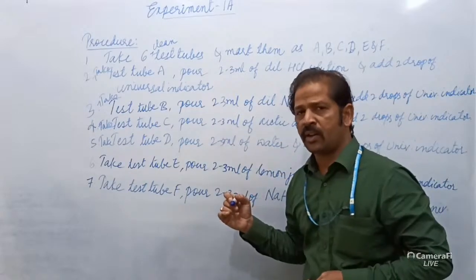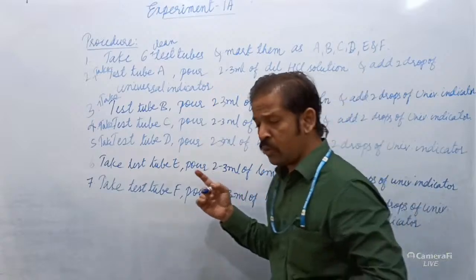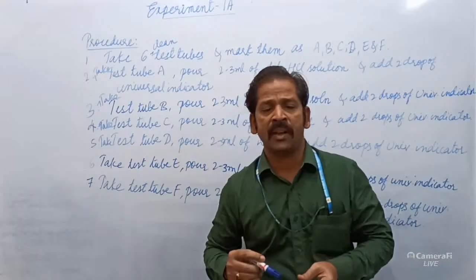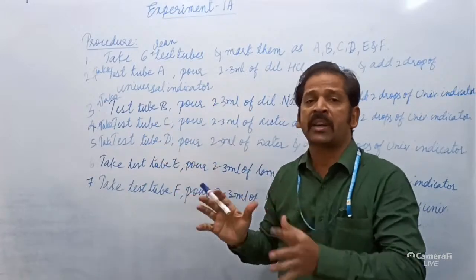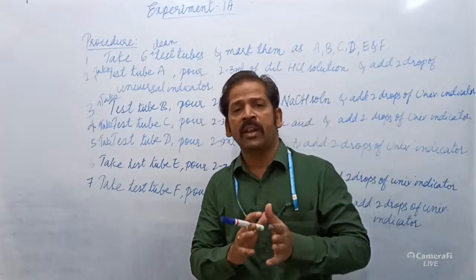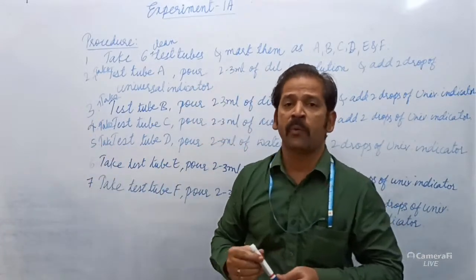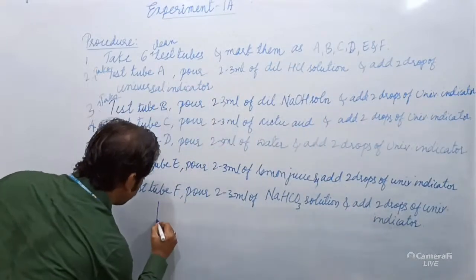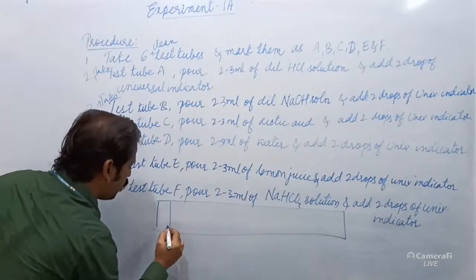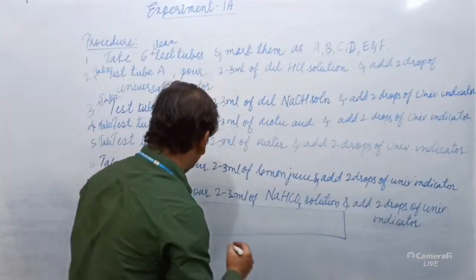Whatever we have discussed about all the chemicals is based on the universal indicator. I told you that day that the universal indicator has a band of 7 colors, like a spectrum. The colors range from violet, indigo, blue, green, yellow, orange and red, from base to acid. Usually 0 to 1 or 0 to 2 is a strong acid.